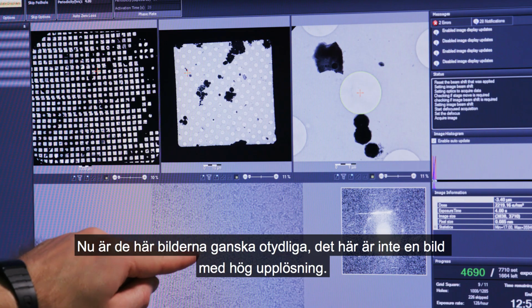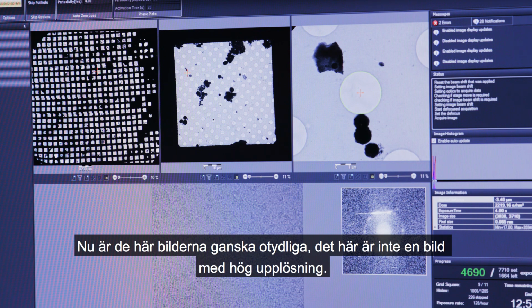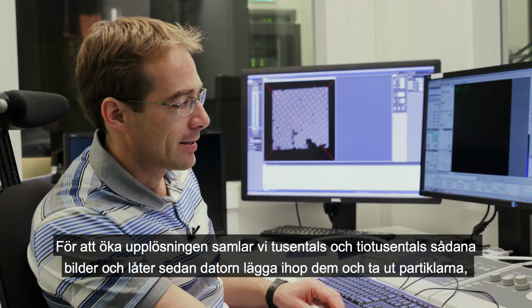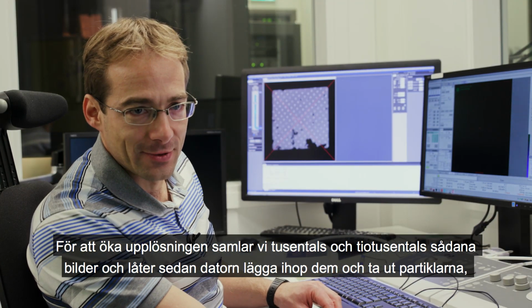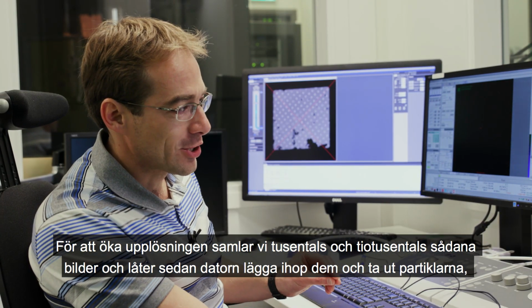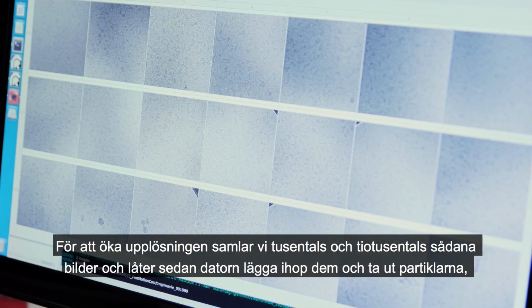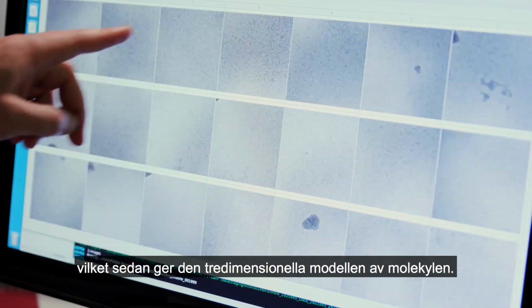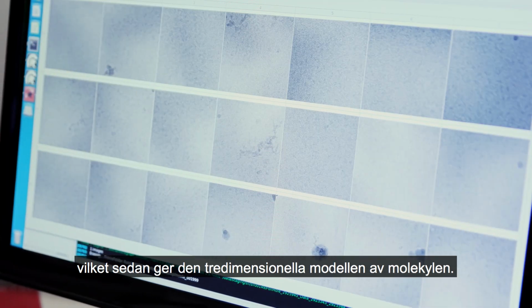Now, these images are quite noisy. This is not a high-resolution image. To increase the resolution, we collect thousands and tens of thousands of such images and then computationally align them onto each other and extract the particles, which then leads to generation of the three-dimensional model of the molecule.